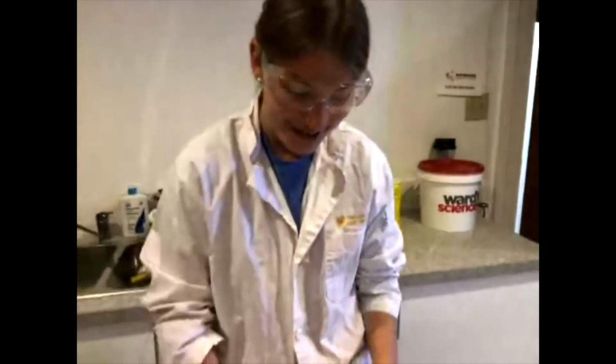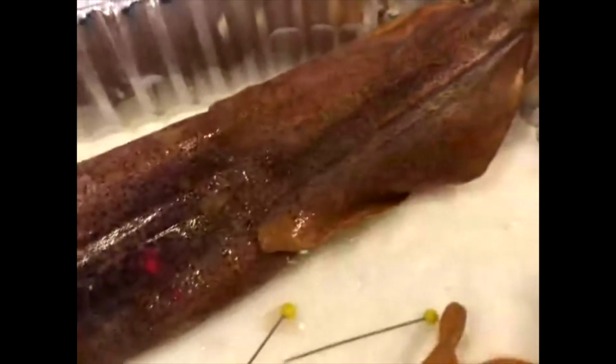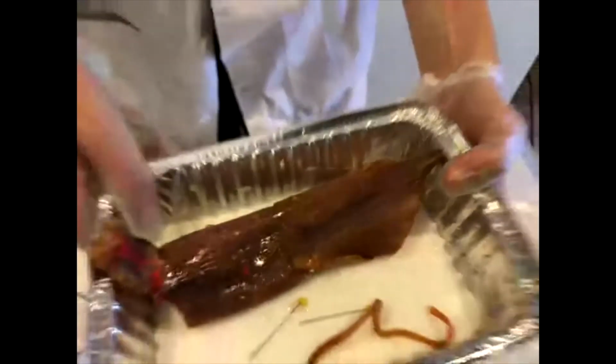Calvin asks, can they change color? Yeah, so I mentioned those chromatophores earlier. If you want to bring the camera down, those dark little spots, they're able to change color so that they can camouflage and change color so that they can attract mates. This guy looks pretty brown though. Some squids also use their pigment cells for communication with each other, which is really cool. Oh yeah, that is cool.